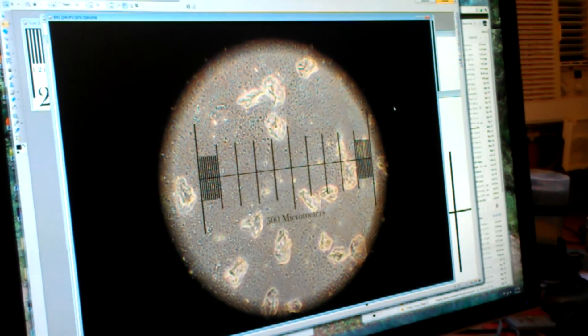Okay, should we look at another human cell? I probably have some blood cells.